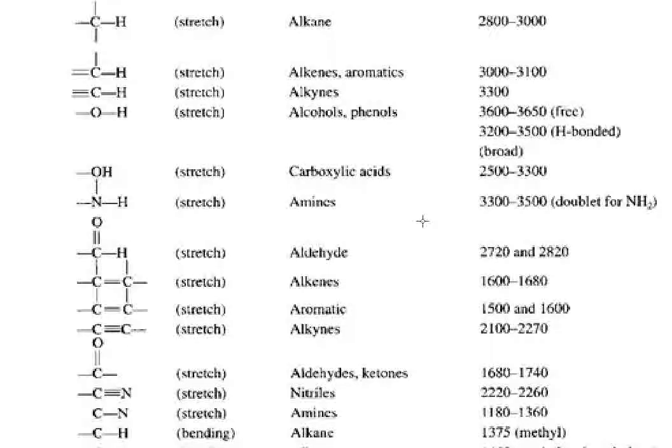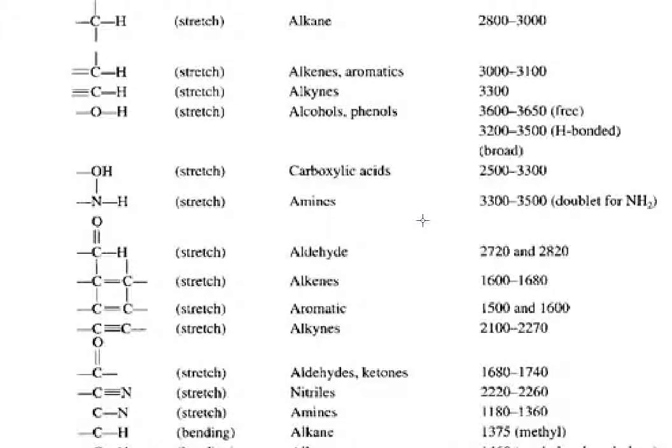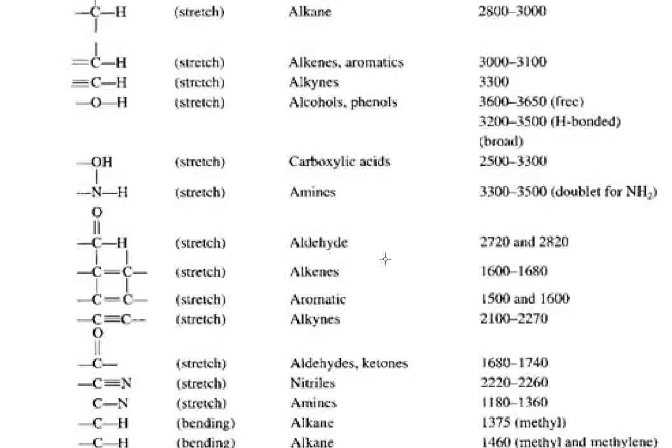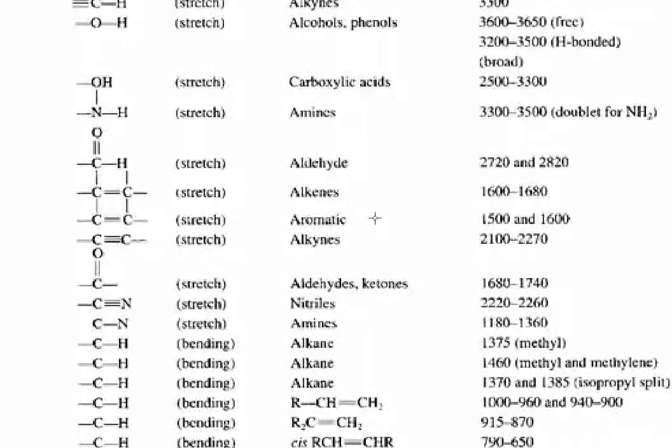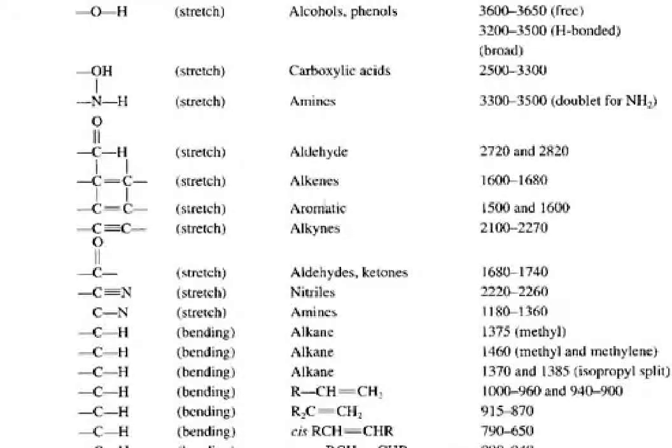Both are possible, so you have to look deeper, further in, to tell. Now, one way to tell that is to look at the CC double bond stretch in your spectrum. There is a similarity and a difference between the frequencies of the CC double bond stretch for an alkene and the CC stretch for an aromatic compound. The CC stretch of an alkene is a peak in the region from 1600 to 1680 wave numbers. For an aromatic compound, it's in a similar location, but a little different.